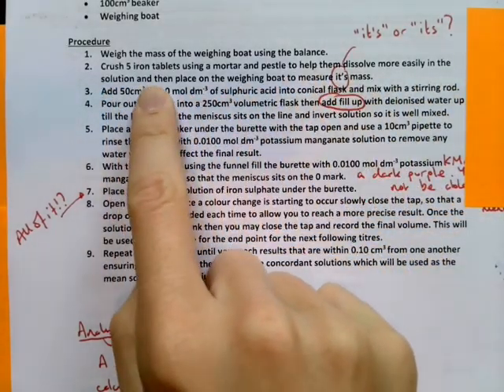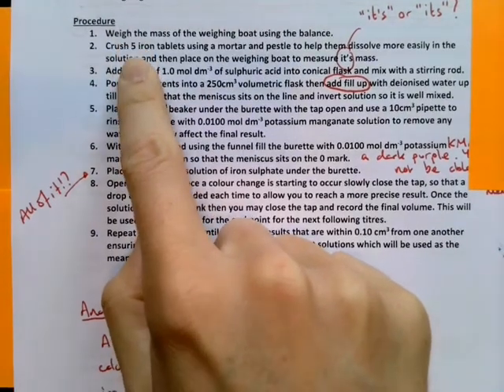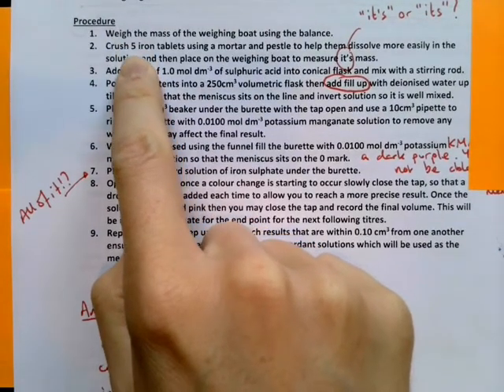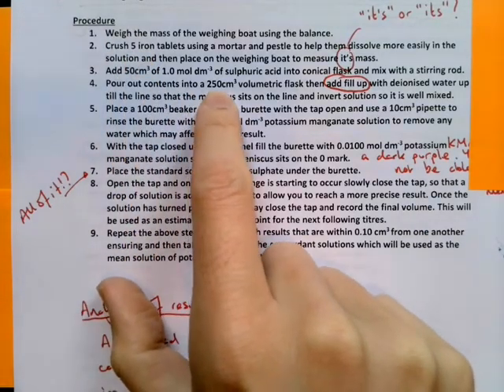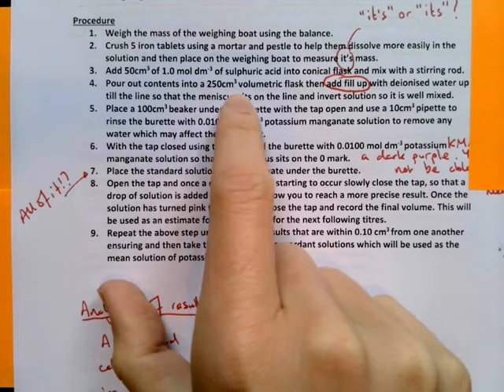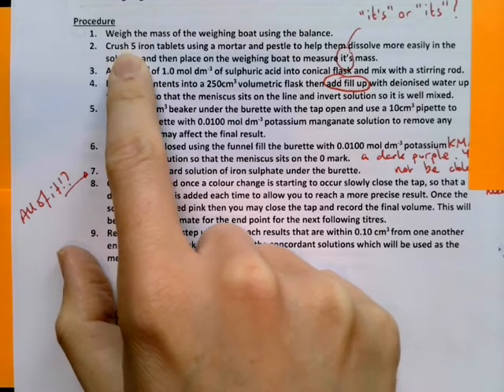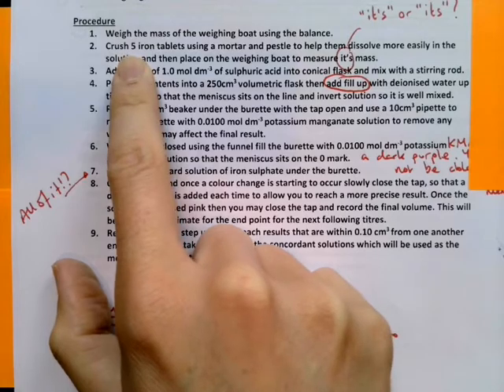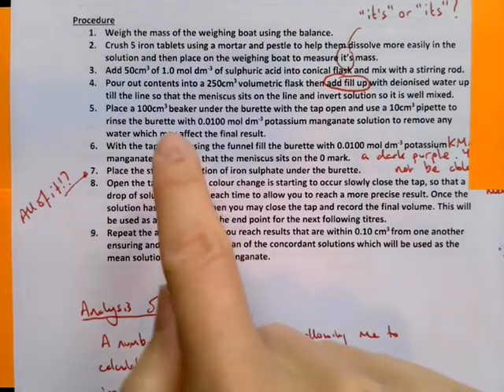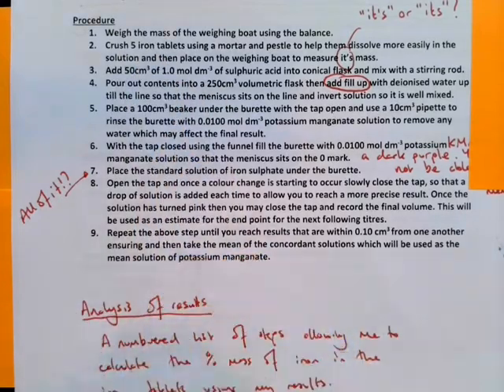So there were lots of obviously different amounts that people used. I think it would be helpful if we had everyone using 5 tablets and 250 centimeters cubed, or a 250 centimeter cubed volumetric flask like this person has. Okay, so some people had 1 tablet and 100 centimeter cubed. Some people had 5 tablets and 100 centimeter cubed. Okay, so all these different variations, but I think it would help if everyone was doing the same amount, at least. All right, so if you could change that.